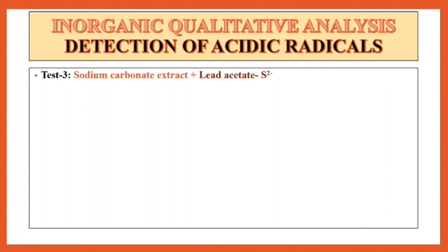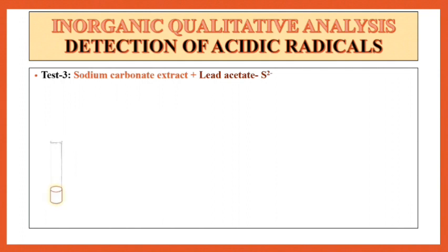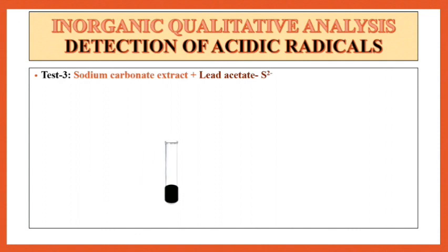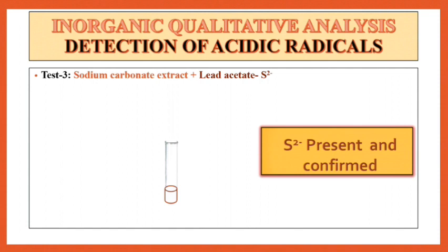Next test is test 3 for the detection of S²⁻ radical. For that, take sodium carbonate extract. To this sodium carbonate extract, add lead acetate drop wise and shake it well. If a black PPT is observed, then to this black PPT add HNO3 drop wise. Shake it well — it is soluble in HNO3. So S²⁻ is present and confirmed.